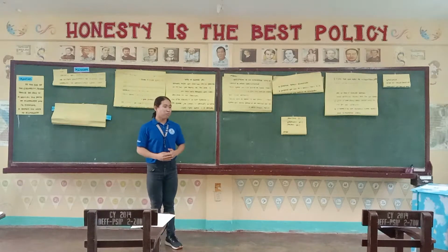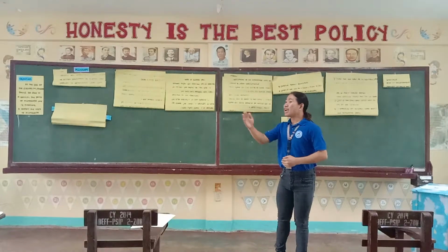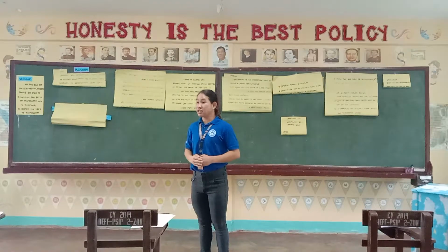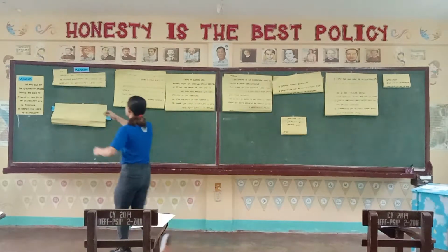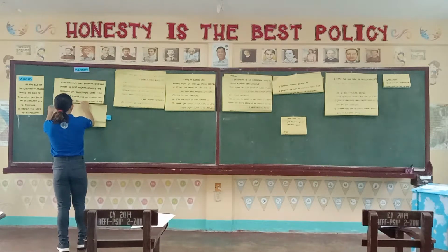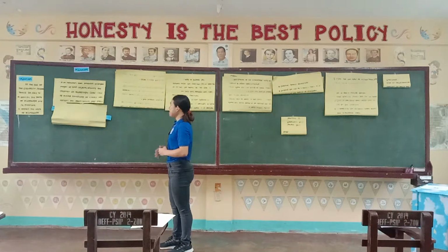Alright, so, who among you here knows what a microscope is? Yes, Miss Pasco. A microscope is used to magnify cells. Okay. This is the true meaning of a microscope. A microscope is an instrument that produces enlarged images of small objects, allowing the observer an exceedingly close view of minute structures at a scale convenient for examination and analysis.